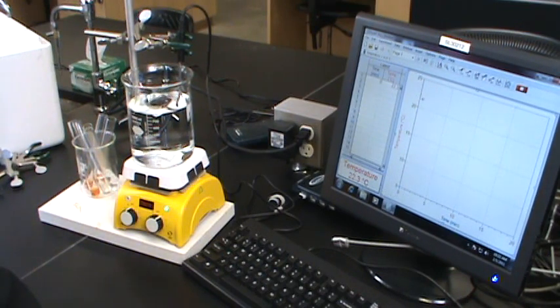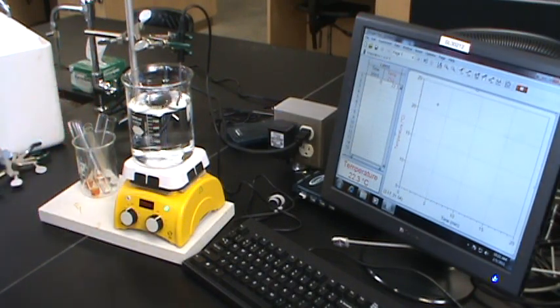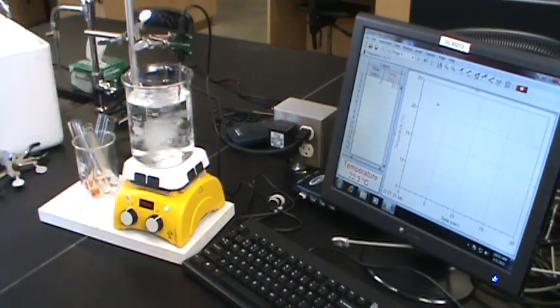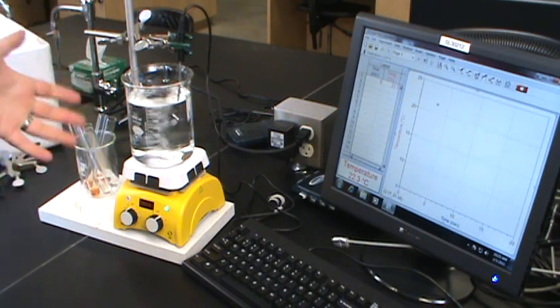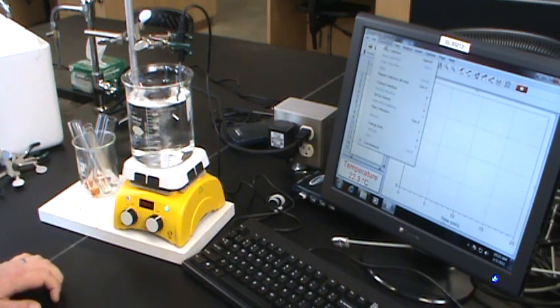So we've got our data collection started. We want this to be around 10 degrees C. So grab some ice and start cooling. That first handful of ice, that first dose of ice is probably going to... Uh-oh, I need to set something up here.